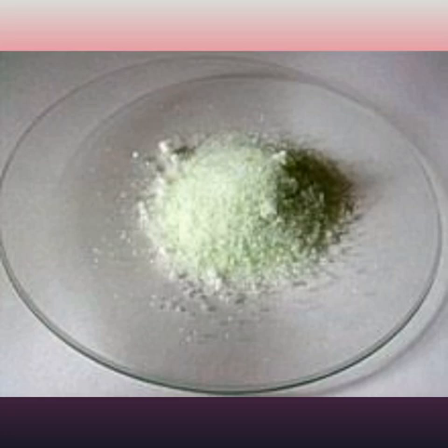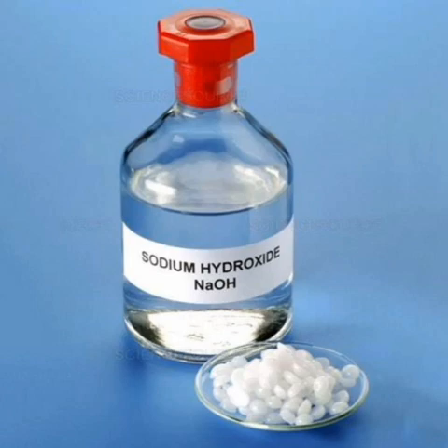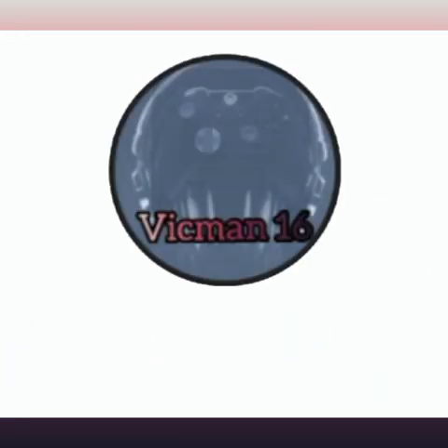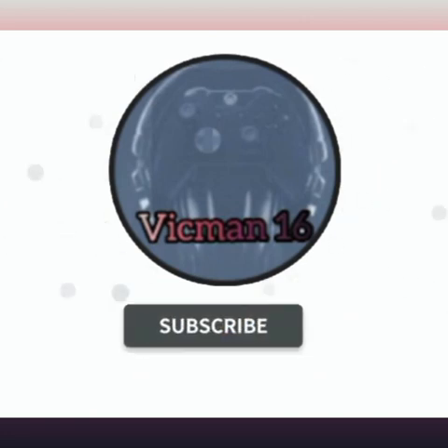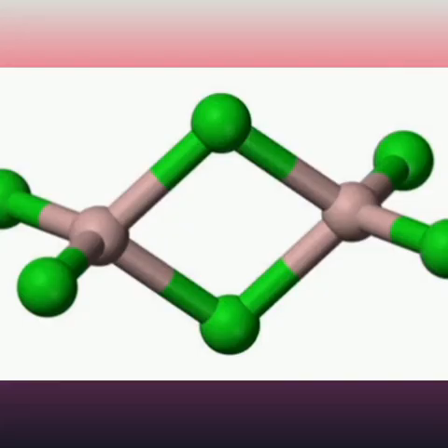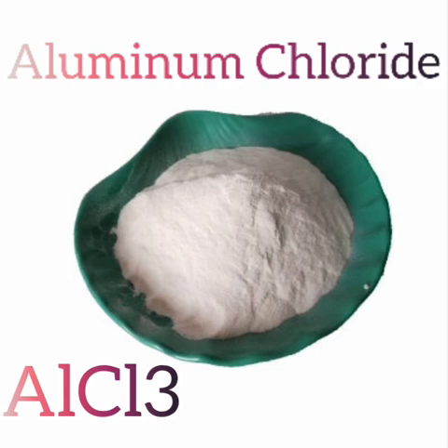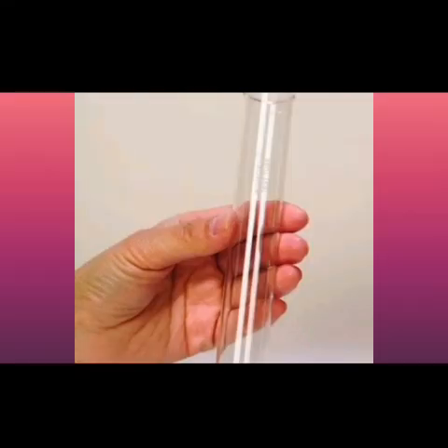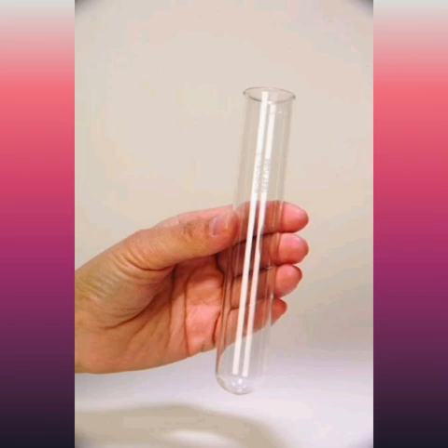So let's begin with the first salt analysis. I won't waste too much of your time. For this NECO chemistry practical, we are going to be analyzing two salts, which are aluminium chloride and zinc carbonate. Now, we're going to distinguish the both of them.